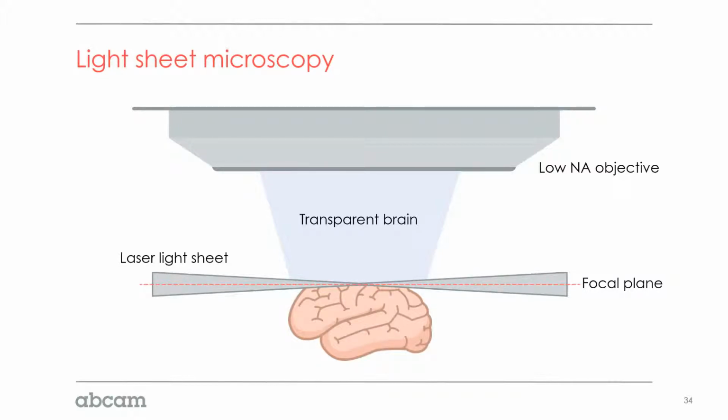Most researchers that we work with use confocal microscopy, and in our own contract research services, we primarily use confocal microscopy. A lot of times we use high-content automated confocal microscopy because we can set up many, many 1 millimeter sections of mouse brain tissue or liver tissue all at once, and we can use an automated confocal inverted imager to image all of those tissues for a day or more to collect all of that data, whereas if you try light sheet microscopy, that throughput is going to be much lower, but you can image a larger volume more quickly.